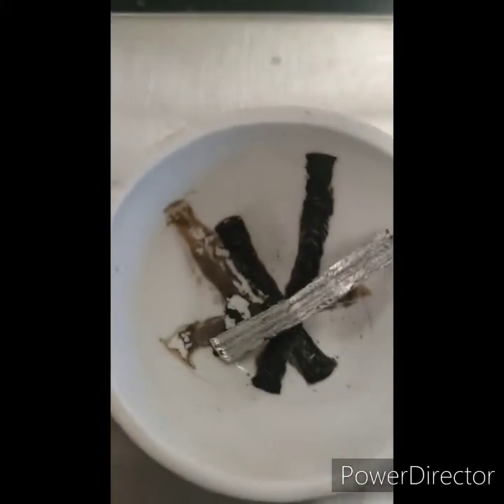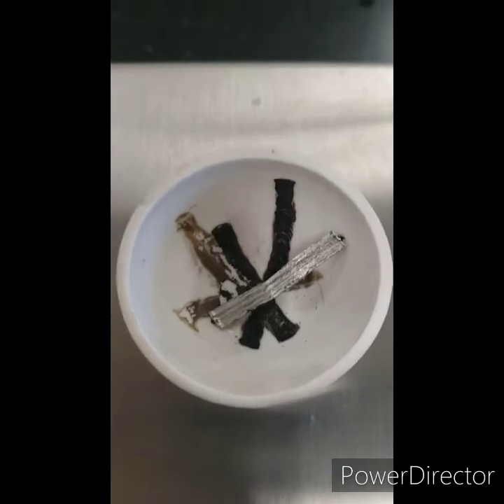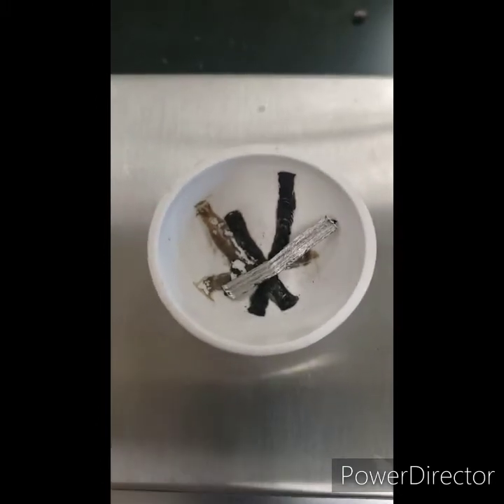Did you notice that there are a lot of markings in the crucible? That's from previous times when it was used. Those burnt marks are a permanent part of the crucible now.